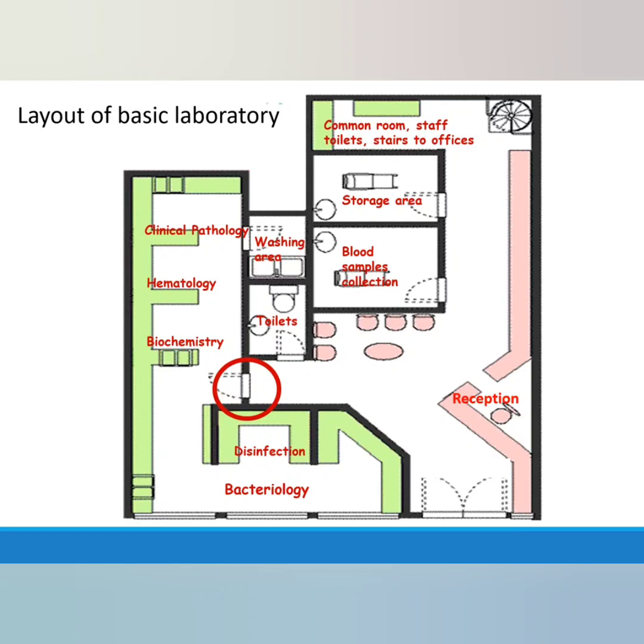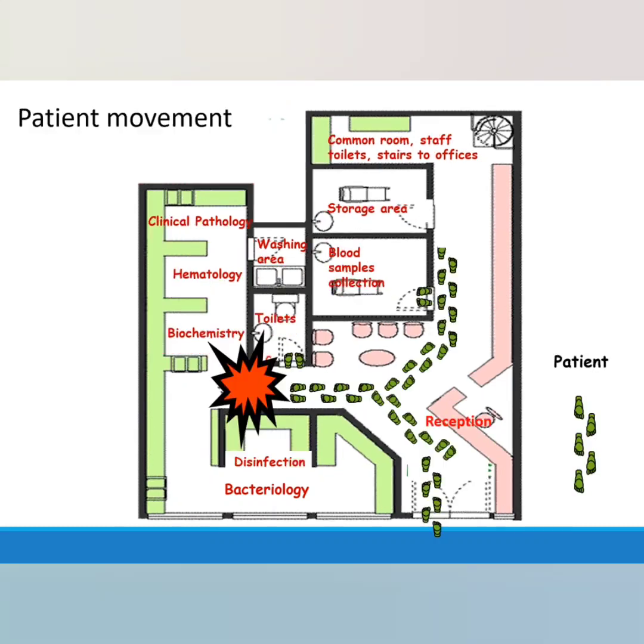Within the laboratory, there are different sections and areas for washing and disinfection. There is a separate storage area and staff room and staff toilets, and there are stairs leading to the office area.